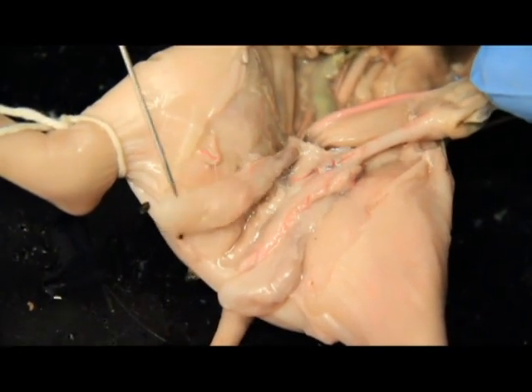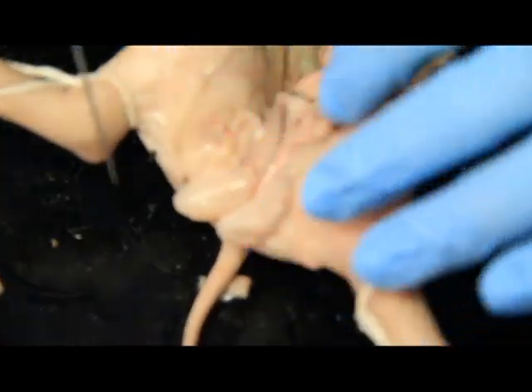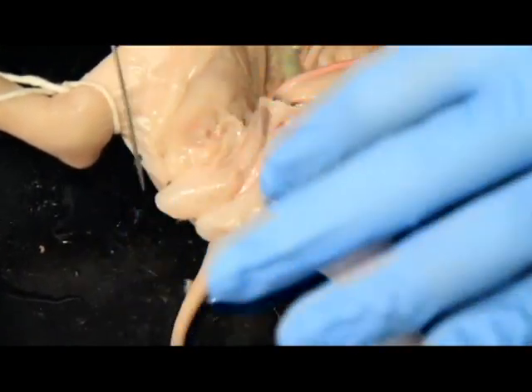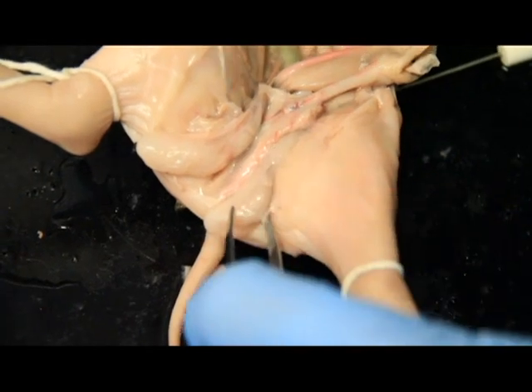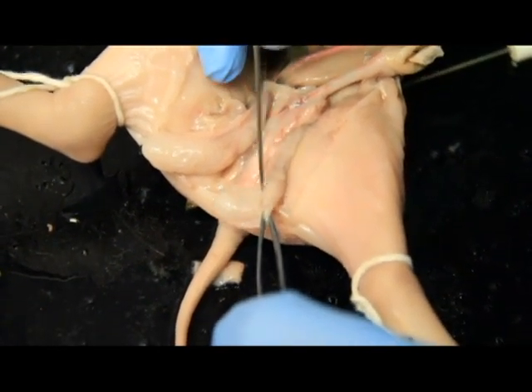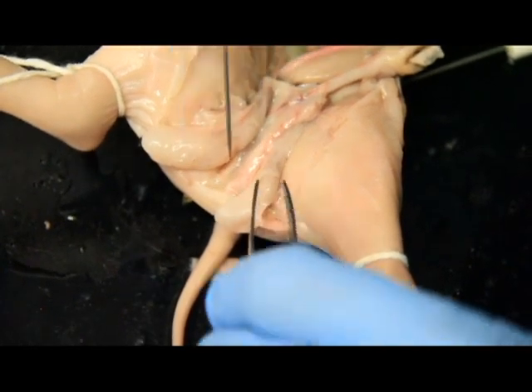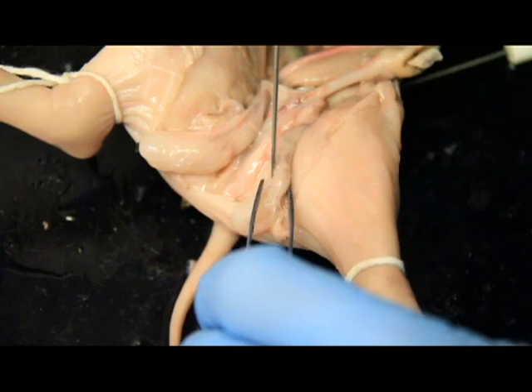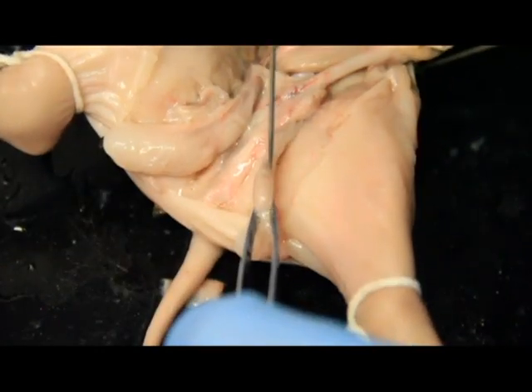On either side here, you can see these are the scrotal sacs. So remember when we had them closed and it was covered, that's the scrotum. Each one of these individually is a scrotal sac. And then inside of these, if I were to pick this membrane away, as I pick this membrane away, you can see this darker ball part. This actual round bean looking shape right here, that's the actual testis itself.